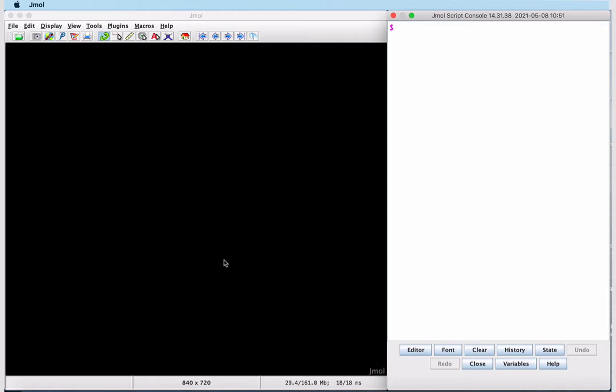Here we have a JMol interface with a structure viewer on the left and the JMol console where typed line commands are entered on the right.